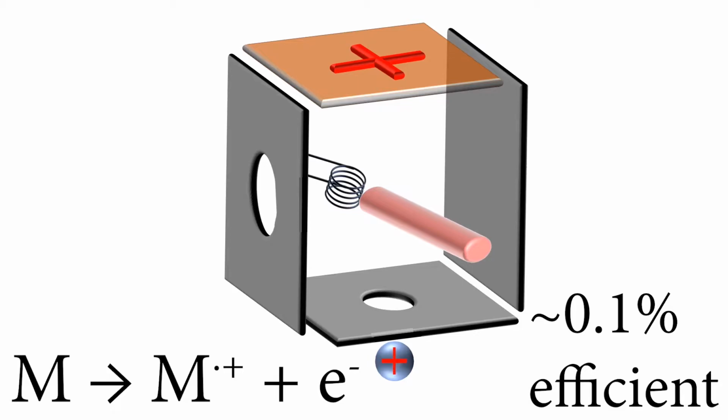The efficiency for electrospray and APCI, in other words, the number of molecules that you pump in compared to the number of ions that come out, varies enormously. For things that like to pick up protons or get rid of protons, the efficiency can be really, really good, like in the tens of percent or closing in on nearly all of them. But for other things, it can be really small. For alkanes, it's almost zero. EI is pretty constant in its ionization efficiency, but still only about 1 in 1,000 things that wander into the electron beam get ionized. That's still plenty. It still can be a very sensitive and powerful technique. It definitely gets the job done.